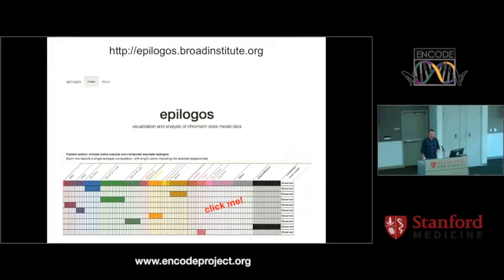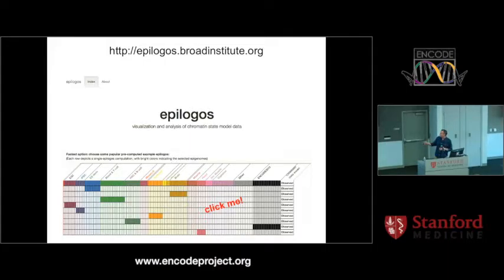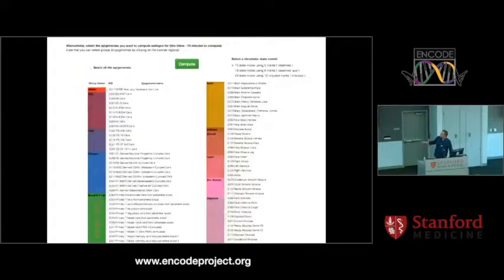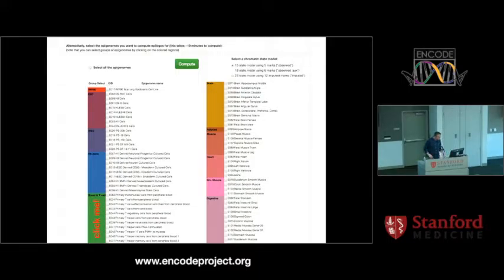There is a prototype website out there that allows you to generate these EpiLogos for different sets of samples. The one I showed before is based on all 127 Roadmap epigenomes, but here on this website you can select any arbitrary subset of epigenomes. The table you see first shows a number of pre-computed scenarios — if you hover over each cell, you can see which epigenomes are included. If you don't like any of the pre-computed samples, scroll down and choose any combination. Mind you, this takes a little bit of time to compute — like 10 minutes — so if you want faster results, choose from single categories or simple combinations.